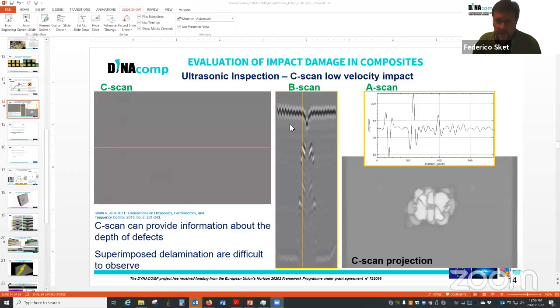It gives a semi-3D information because you have to account for the different speed of the sound wave when the material needs to go through different phases. That being said, you can see interfaces in the different plies. You can see the defects, and this gives you very interesting information with a very simple technique. These gray levels that you have here correspond to the different interfaces. But this inspection needs a certain changing of the parameters of the ultrasonic testing devices.